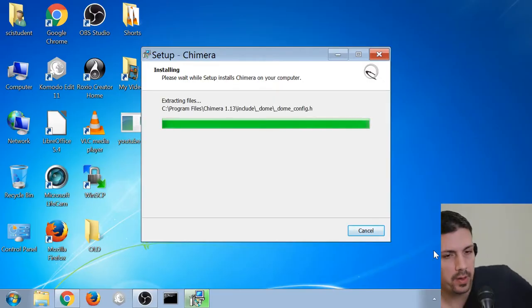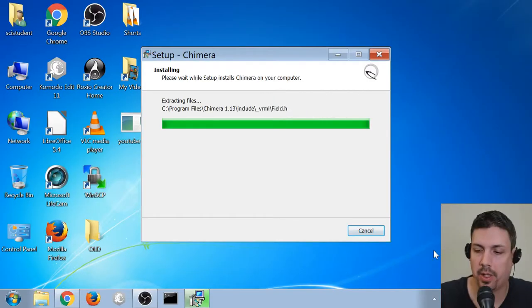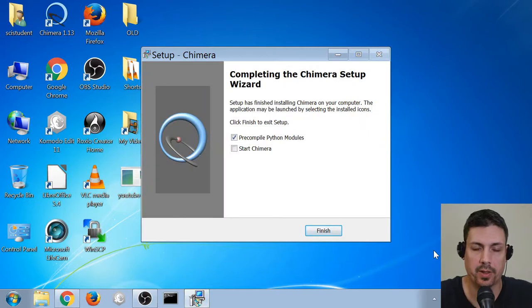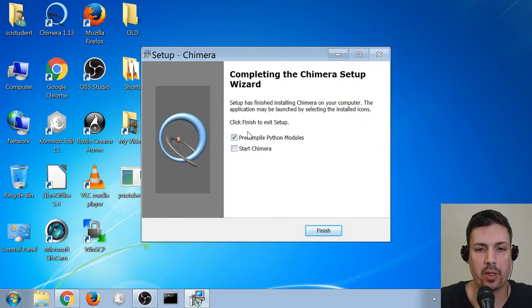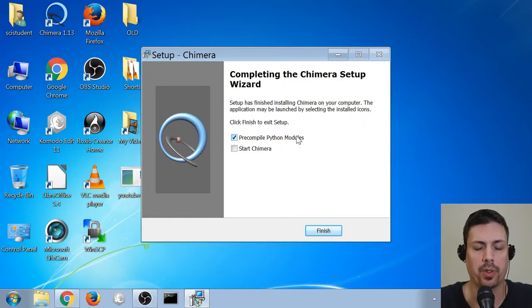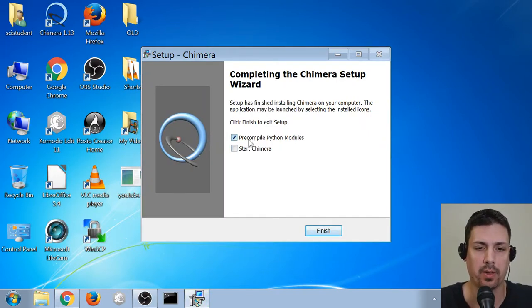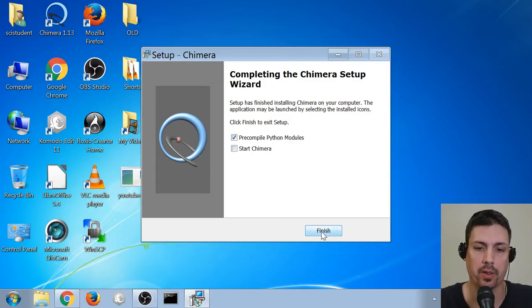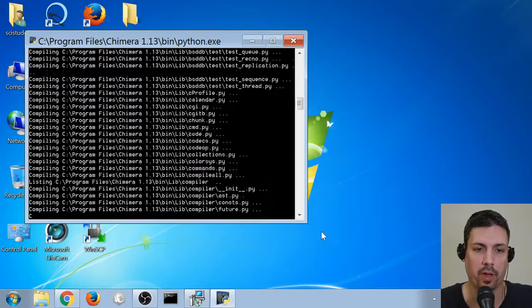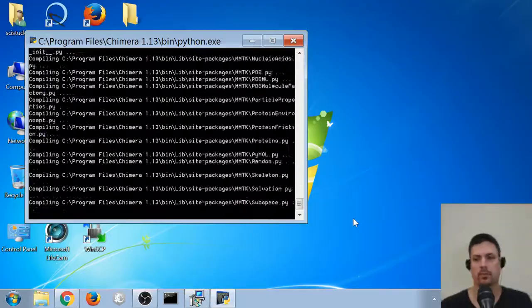Alright, as the installer finishes up here, after it's done, it's going to pop up a menu that's asking you to pre-compile Python modules. I highly recommend you do this, because if you don't, next time you start it, you'll have to do it anyway. So this will take a little bit of time, so again, we'll kind of fast forward through this part.